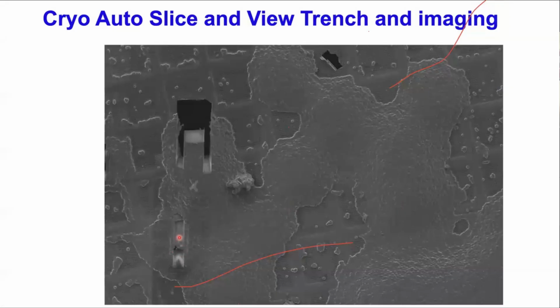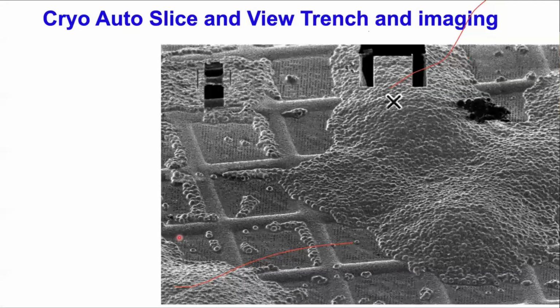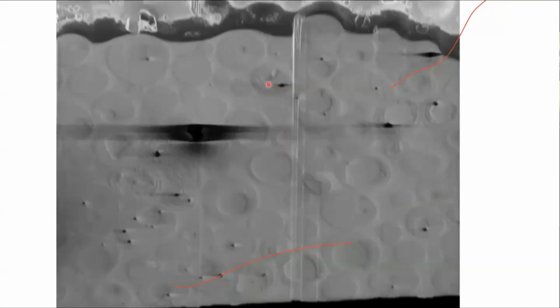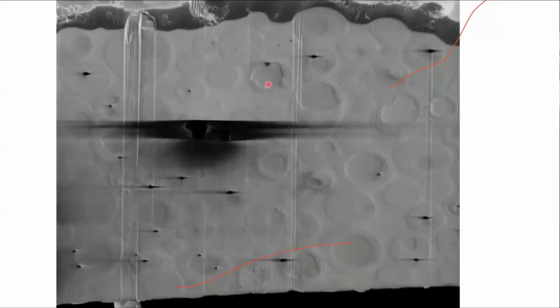But going to this, you have to make some fiducials so that it can be localized, and the whole process you can generate. So the first image was very poor quality. Because I have to tell the ifs and buts to the students, you have to just feel it. And now here we can see it, and later we can improve it after standardization and see the cells.